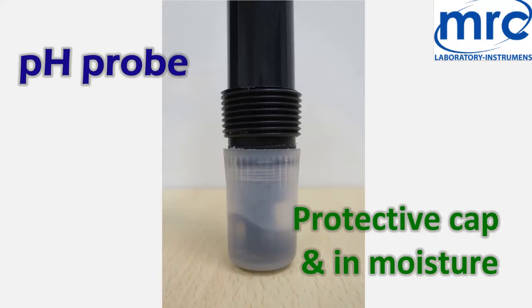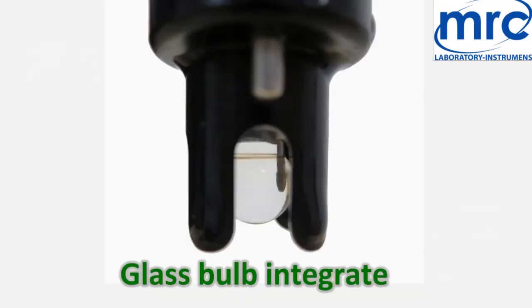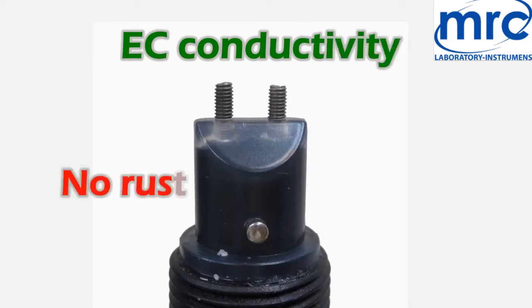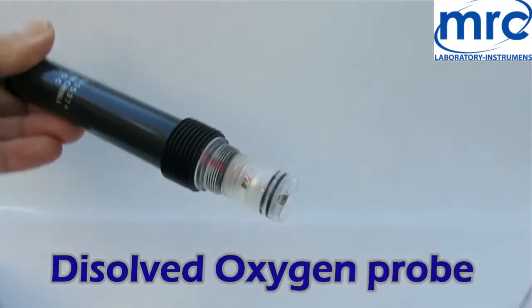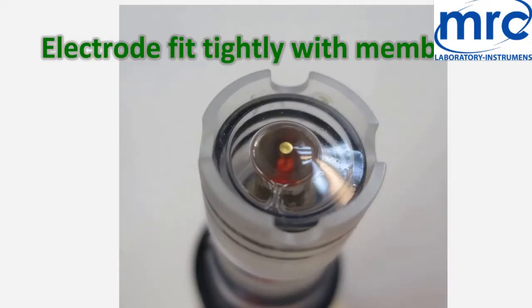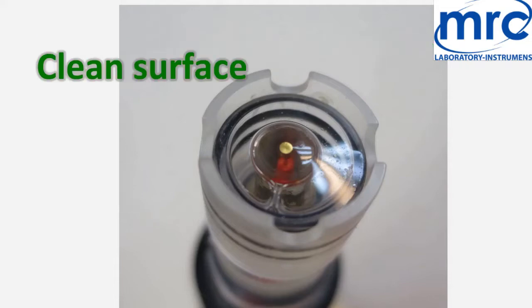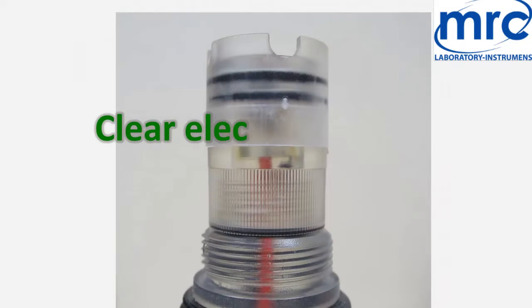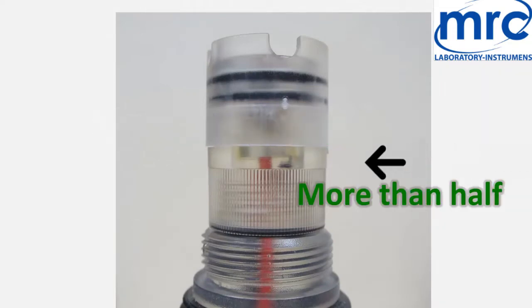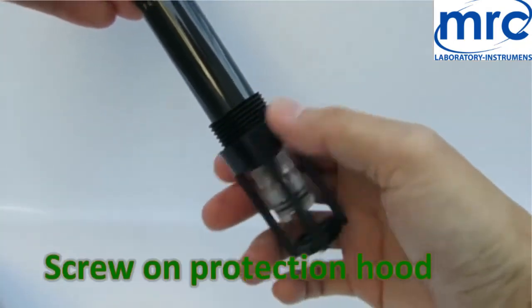pH probe: keep in protective cap and in moisture. Glass bulb should be intact. No rustiness on EC conductivity electrode. For the dissolved oxygen probe, remove the anti-collision hood. Check for no broken electrode, fit tightly with membrane set. Clean surface on electrode working area. Clear electrolyte should be more than half height. It is fine to have slightly soft crystal or precipitate. Screw on protection hood after inspection.